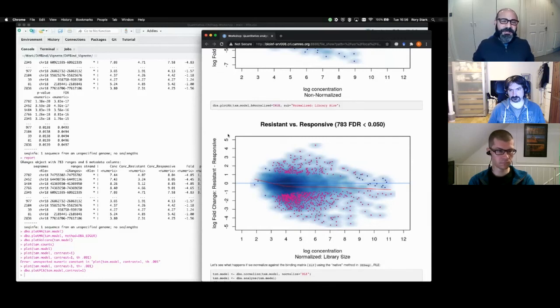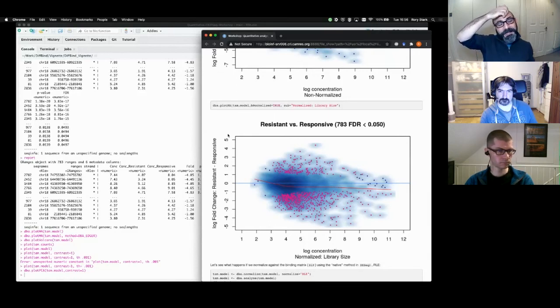People, I think, have a good, well, not a great understanding, but spike-ins is usually where you use exogenous DNA from another species, typically Drosophila chromatin, pulled out. And if you can quantitate it perfectly at the experimental phase, you can normalize to that. But we've actually found that the spike-ins don't work all that well.